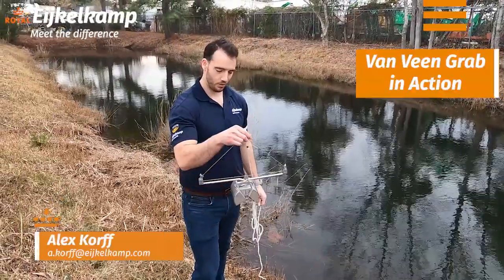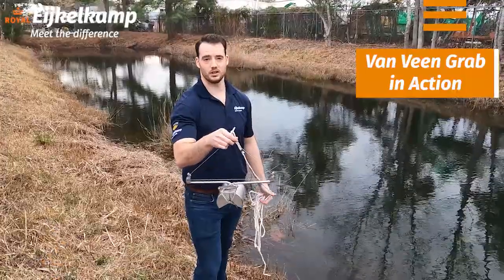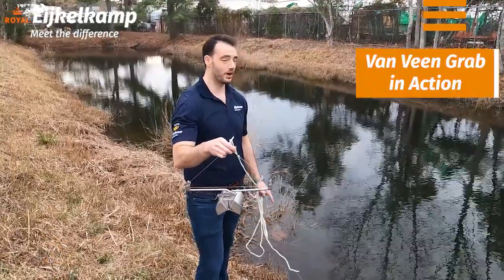Hi, this is Alex with the Eichel Camp and today we're going to show off the actual Van Veen grab. In a previous video we used it on dry land to catch some grass. Today we're actually going to sample it out here in this little pond in Wilmington.